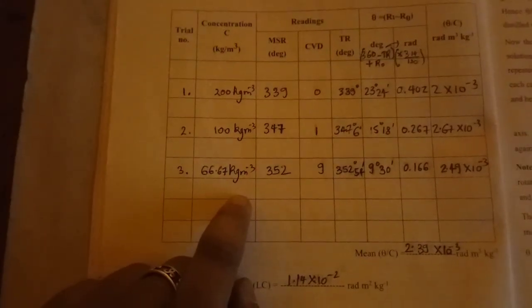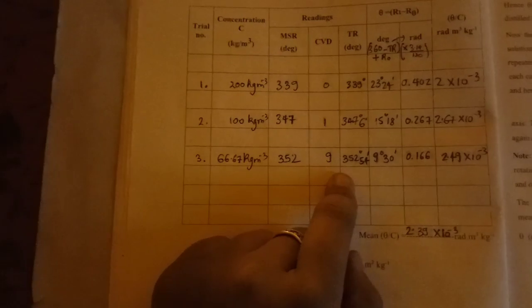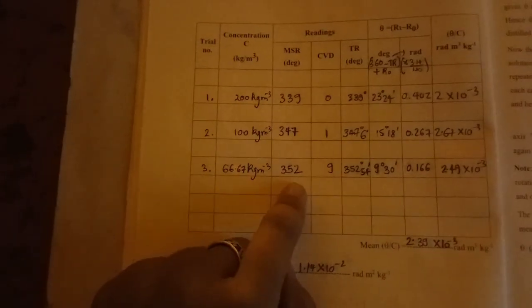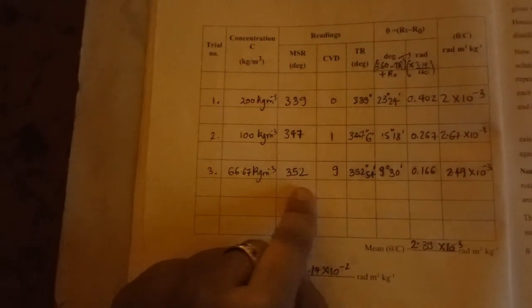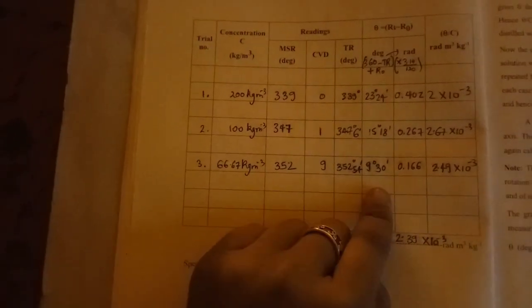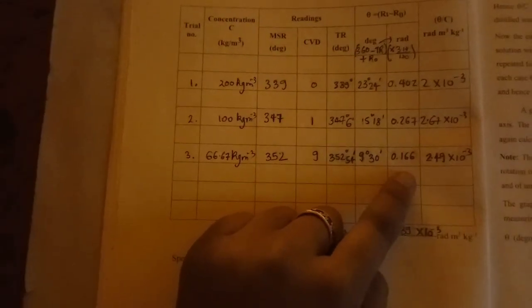And once that's done, like I said, the brightness will be different from before. The brightnesses were exactly the same, but once you add a new concentration, once again you'll have to rotate it by a certain amount to get equal brightness. When you get that, you can note down the main scale reading, CVD and total reading, find the value of R1 minus R0, find it in radians, and that's the tabular column.